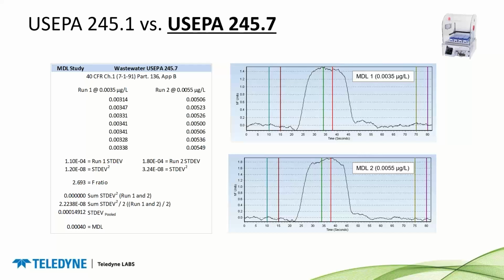so 3.5 and 5.5 ppt. And you can see the peak profiles for those off to the right. And my final MDL came in at 0.00040, or 0.4 ppt. So this illustrates just how sensitive this instrument really is.